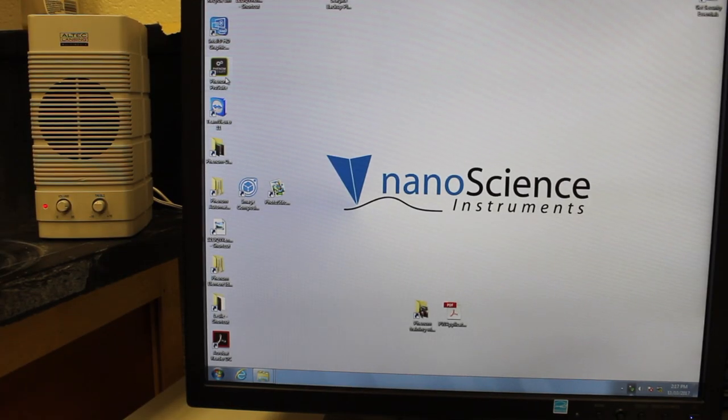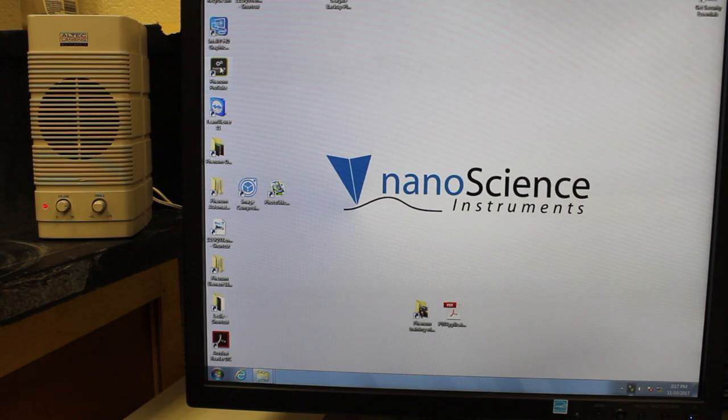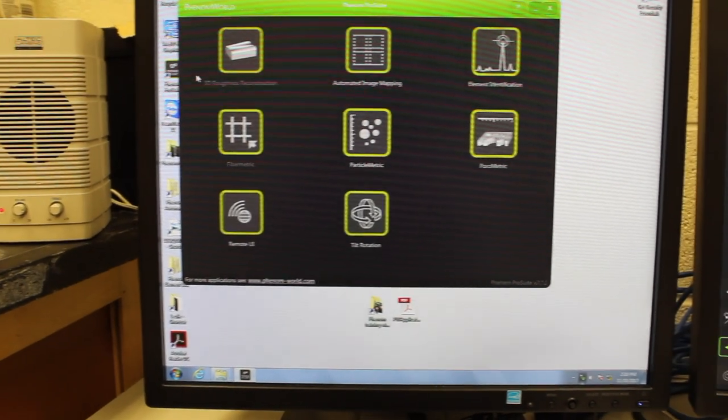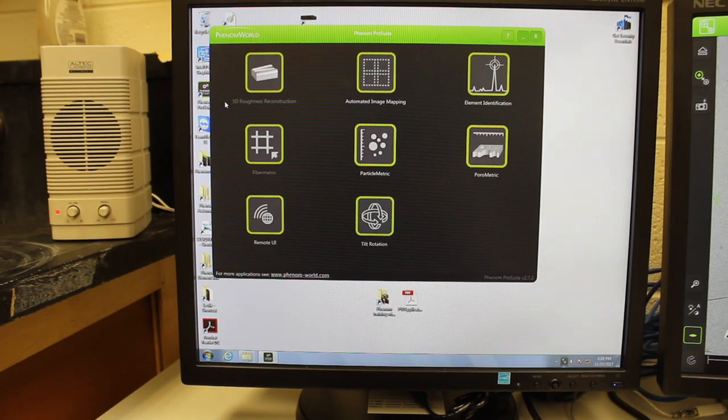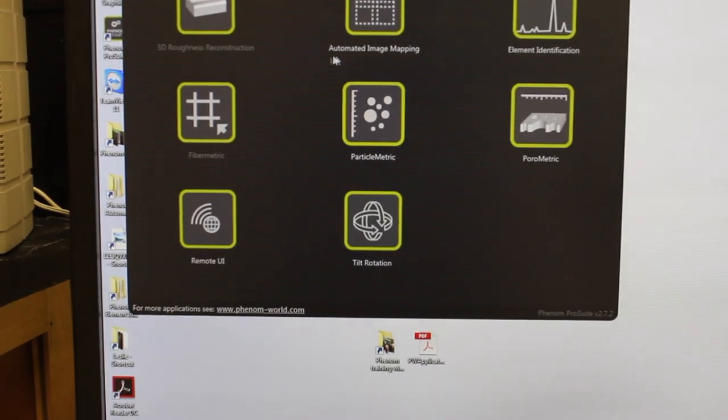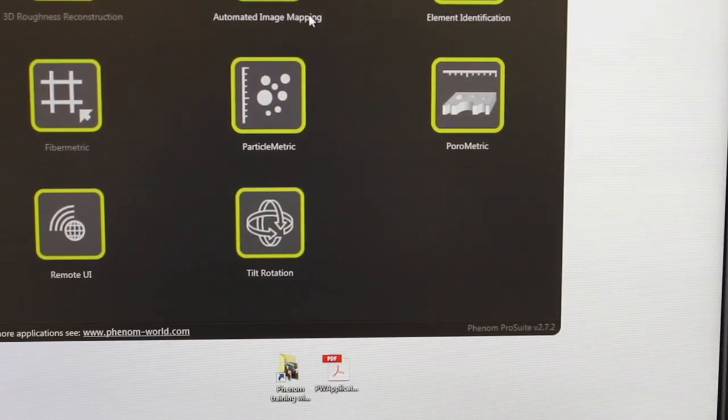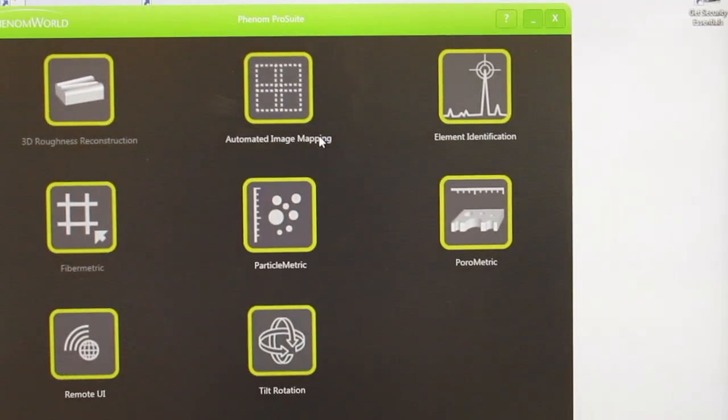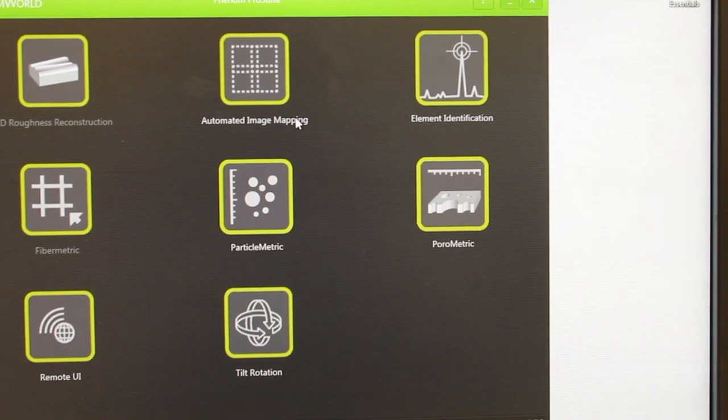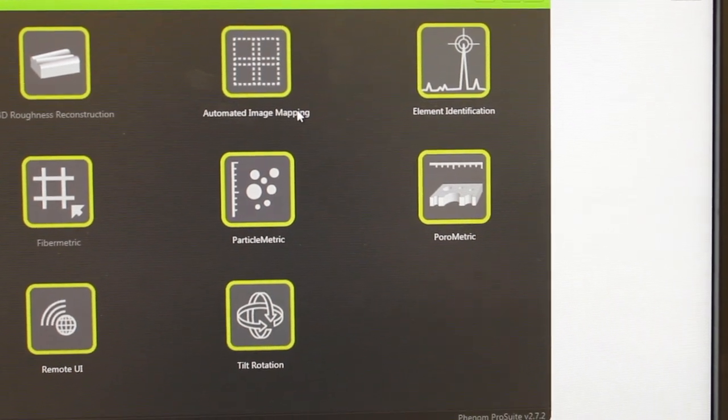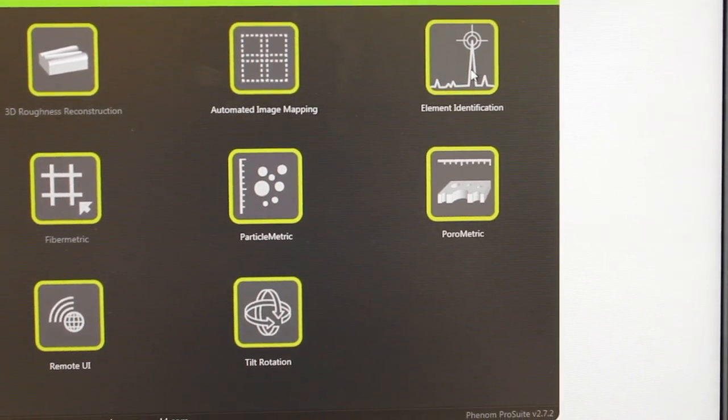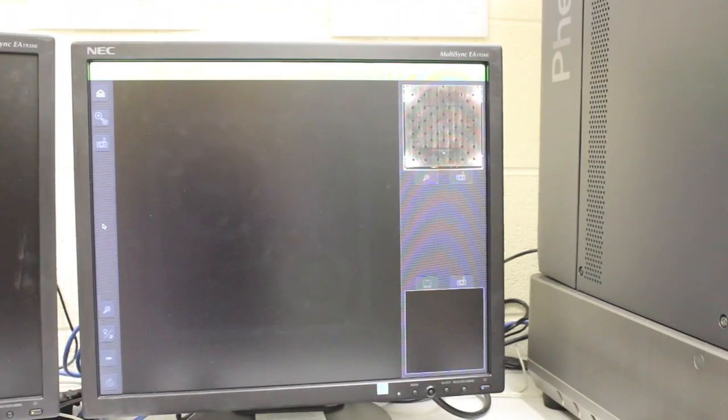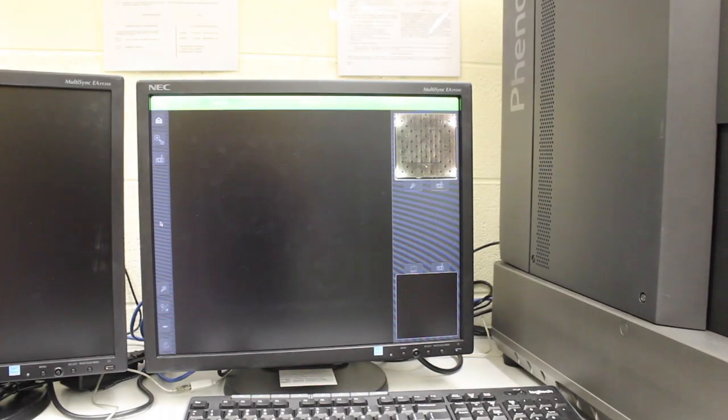To use the EDS, you need to start the Phenom Pro Suite on the left side computer. We're going to identify the composition of materials, so we want to choose the option at the top right called element identification. That's going to bring up the element identification screen on the computer.